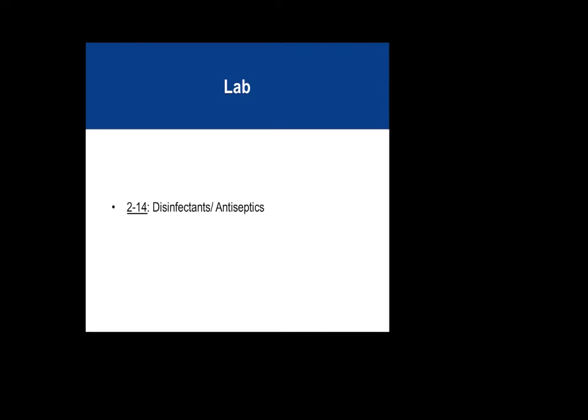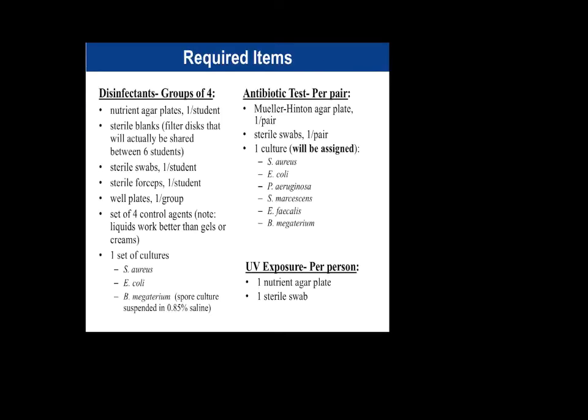I've had students bring in the makeup brush cleaner or some other personal cleaners. I'll just leave that one there. But we get to see all of these different results of these products. So unfortunately today we're going to be doing it online, but that's okay. We'll walk you through it and I'll show you some results from classes of past.